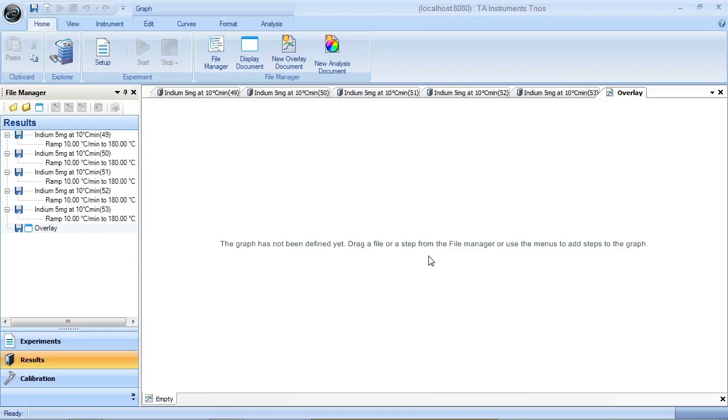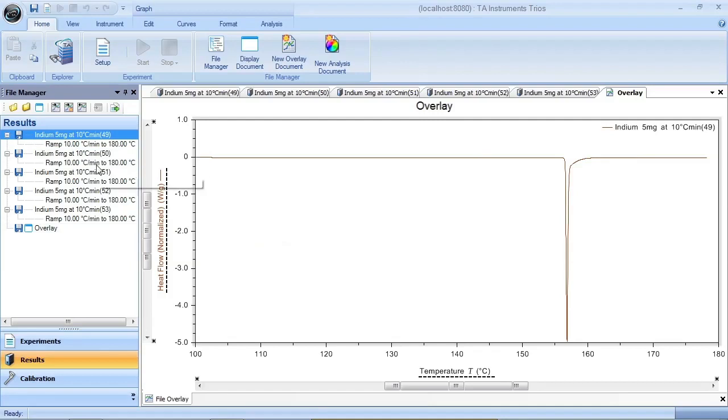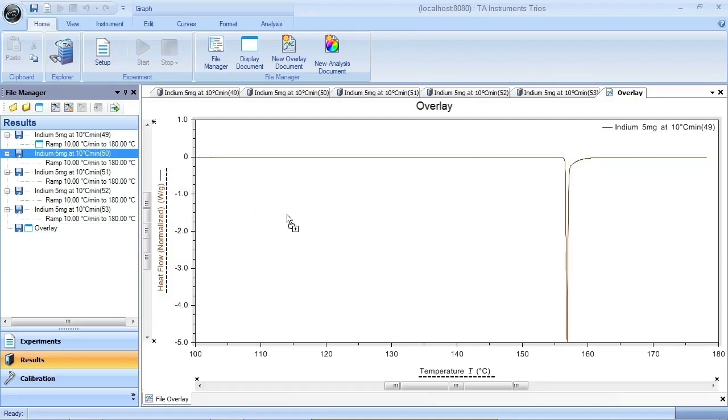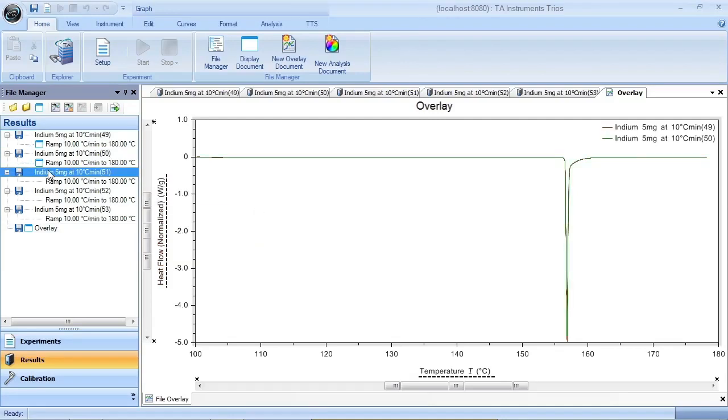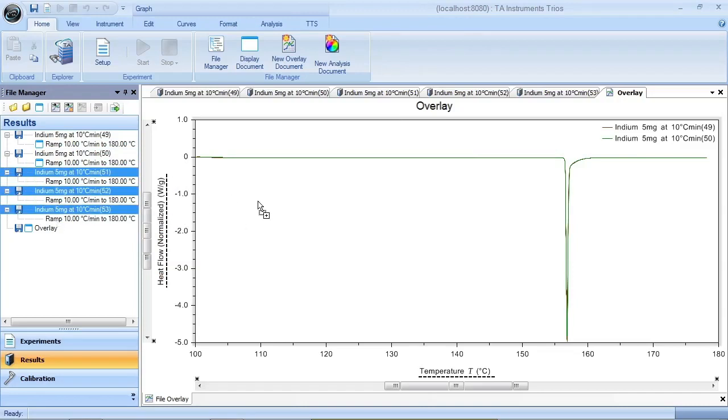And you can easily move experiments through an overlay document. Simply go to your file manager, click on the file, and drag it over. Now go to the next file, drag it over. You can select multiple files, just hold down the Shift key, select the files, and drag them over. It's as easy as that.